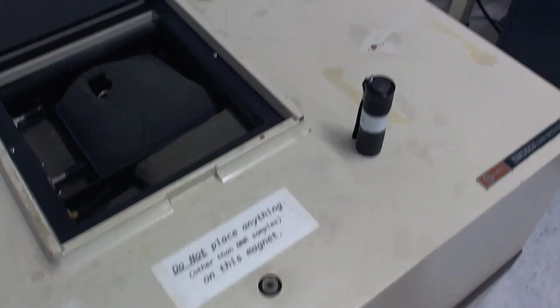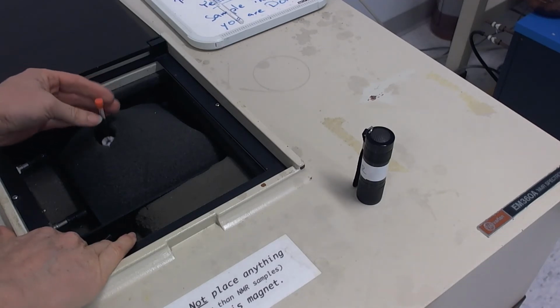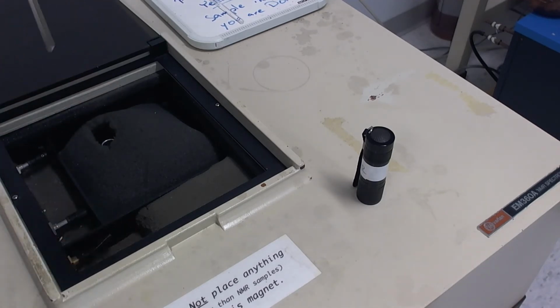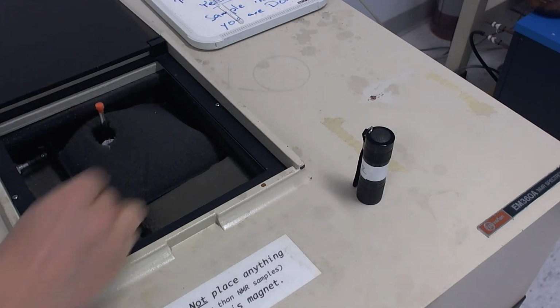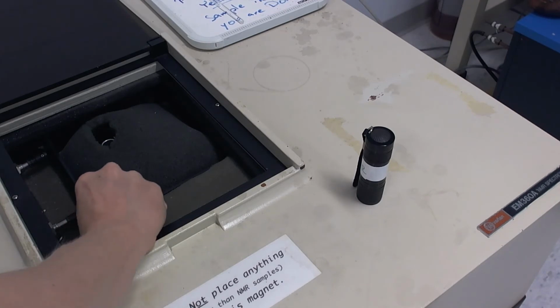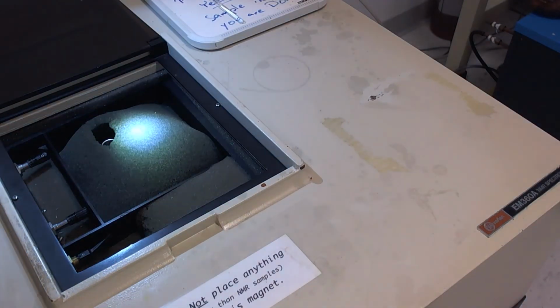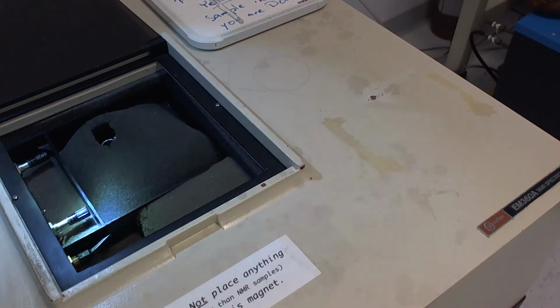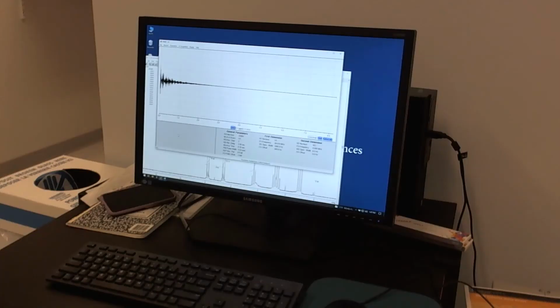One more time, if we eject a sample, press the button. Be ready to touch the sample. To insert the sample, rest it here. Move the lever to make the sample spin. Put the lever back to its original position. Use the flashlight and check and see if it's spinning. Once your sample is inserted, you come to the computer.